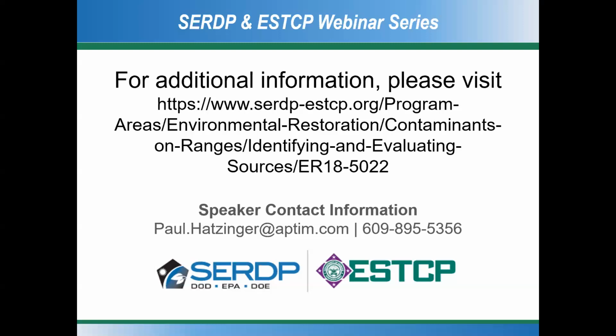And then within USGS, the Reston Isotope Lab analyzes a variety of different compounds commercially. You can send samples to them commercially. They don't do chlorinated volatiles, but they do things like nitrate isotopes. They'll do water isotopes, which can be helpful for various people. But yeah, not everything is commercially available. But a number of these, and certainly for chlorinated solvents, are out there, and the costs, I showed the costs, they're really not extreme these days to get this done.